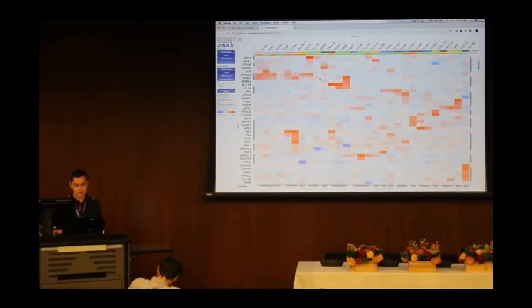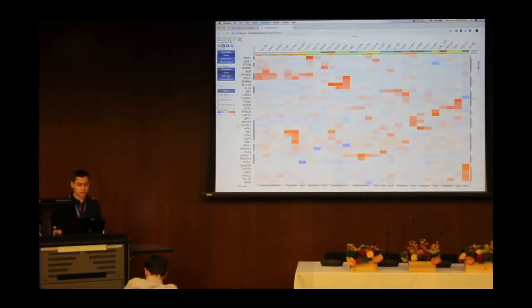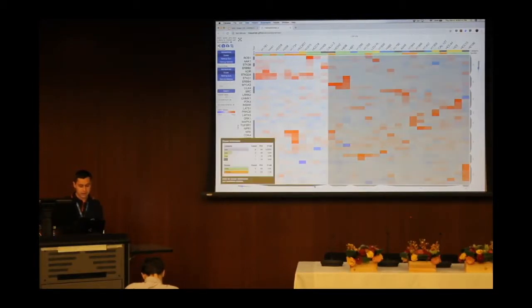You can zoom in, you can reorder, so we see structure here, and we have a compactified dendrogram, so we can choose larger and smaller clusters. We can find here a cluster of cell lines, and we can see the breakdown of categories in that cluster. It's also performing the Fisher exact test to tell us the likelihood that you would have picked that many data points from a particular category from that cluster. So it immediately allows you to compare data-driven clustering to prior knowledge in the form of categories.